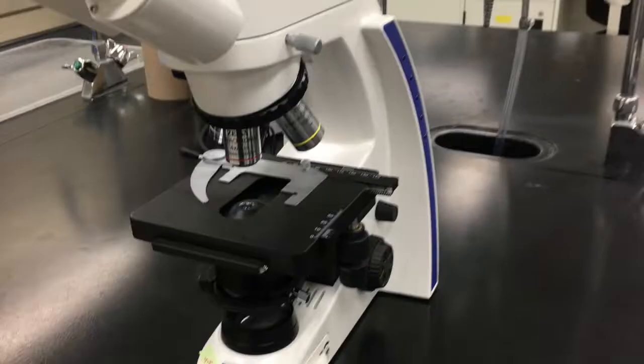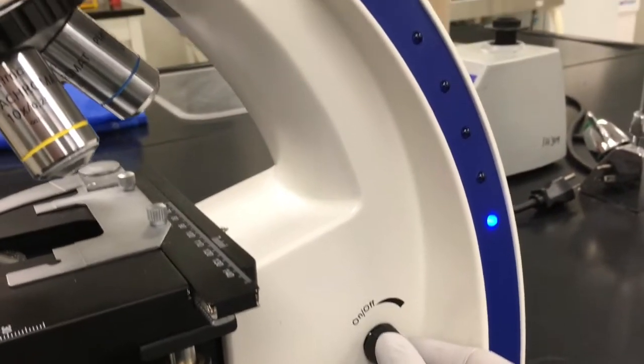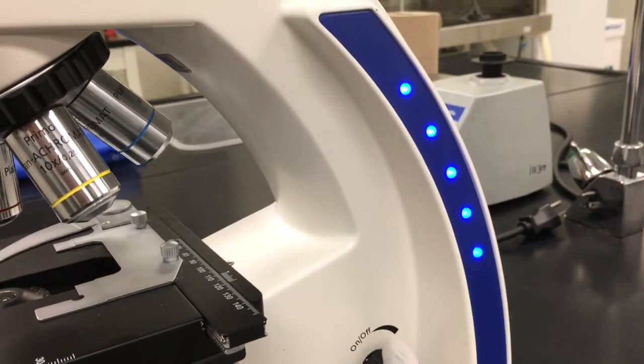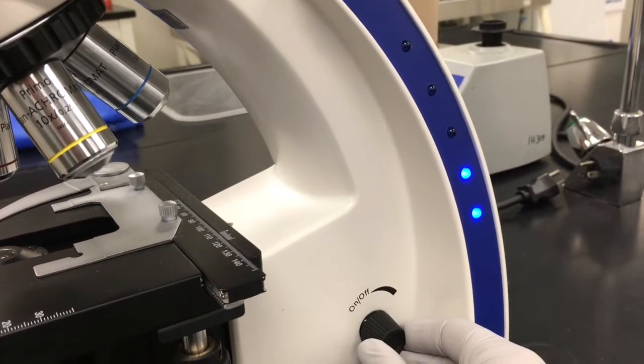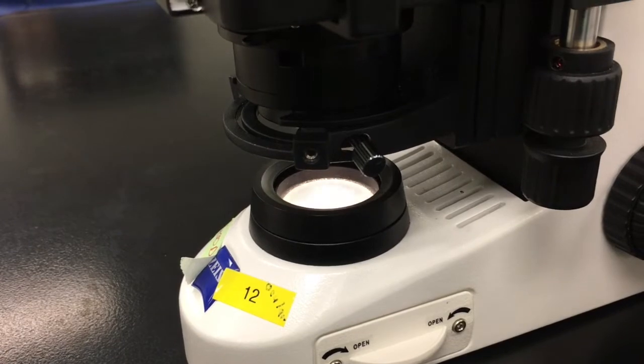Microscopes can be found in the cabinet at your station. Once plugged in, the on-off switch will increase the light intensity of the bulb of the microscope. The higher the magnification you're using, the more light you need. As you begin to find things with your microscope, start with the lowest power and work your way up as needed.